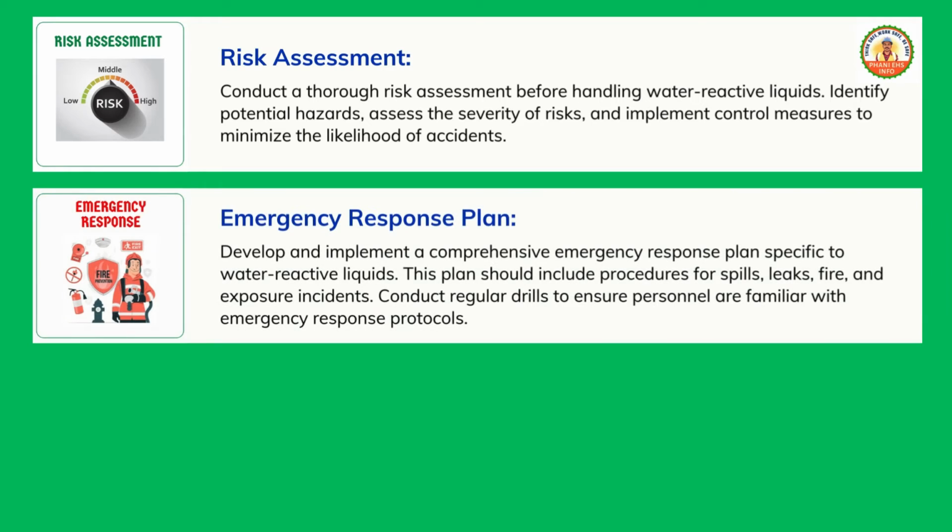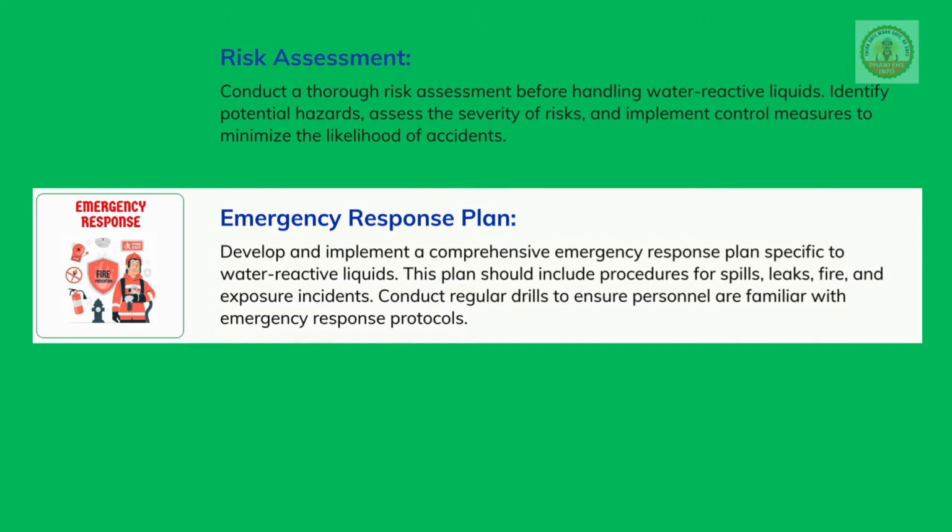Emergency response plan. Develop and implement a comprehensive emergency response plan specific to water-reactive liquids. This plan should include procedures for spills, leaks, fire, and exposure incidents. Conduct regular drills to ensure personnel are familiar with emergency response protocols.